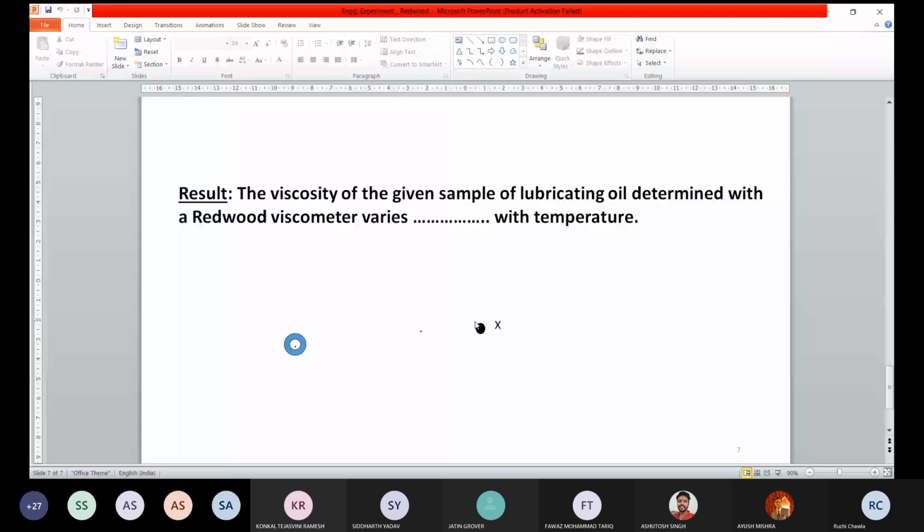And as far as the visibility problem is concerned, what should be done is this: you make a point, you locate it on the graph, and then you circle it with the help of the pencil again. So that circle actually highlights the point on the graph. Though the circle will not be of this kind, I could not make it with the help of PowerPoint on this slide. Simply, you will locate the point on the graph and circle it with a pencil and not do it this way.